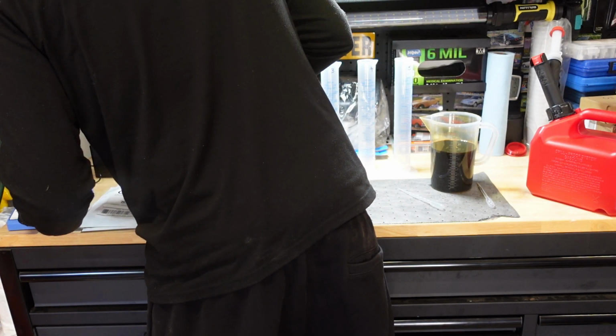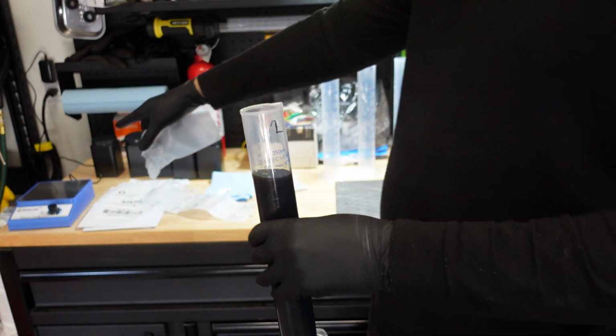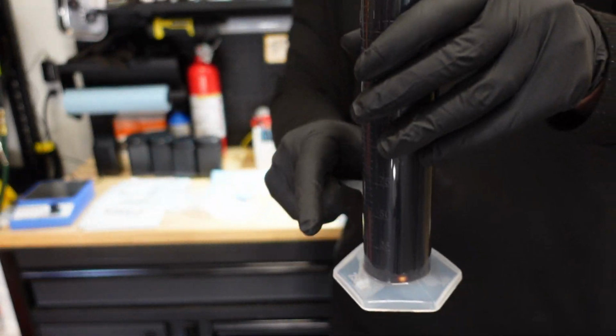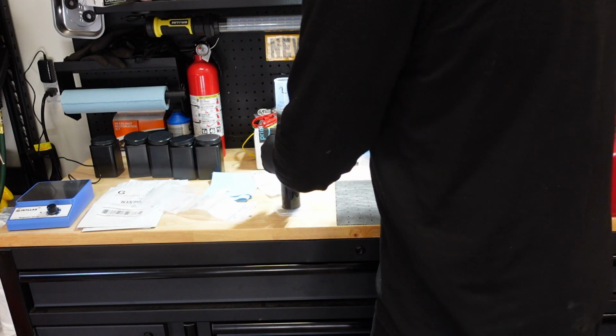Since it appears that this is not spinning it, because again, I didn't think it was going to spin it because this is only a $25 stir plate, and this oil is kind of thick, and you might need a bigger column here with a bigger stir bar to stir it. So it just may not be that.